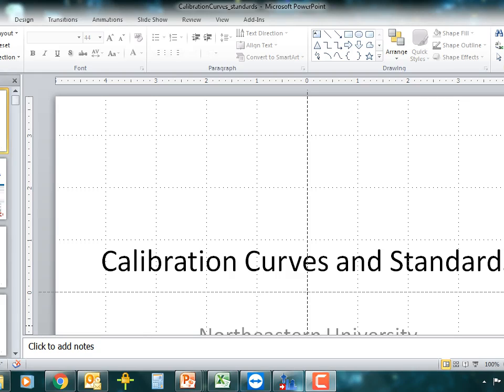We'll be discussing, it's in the wrong order, but we'll be discussing standards for these quantitative experiments and then how to set up calibration curves. And this is one larger slide deck, and the last half of it is a step-by-step walkthrough on some of the things that you would do in Skyline to build a calibration data analysis processing method.